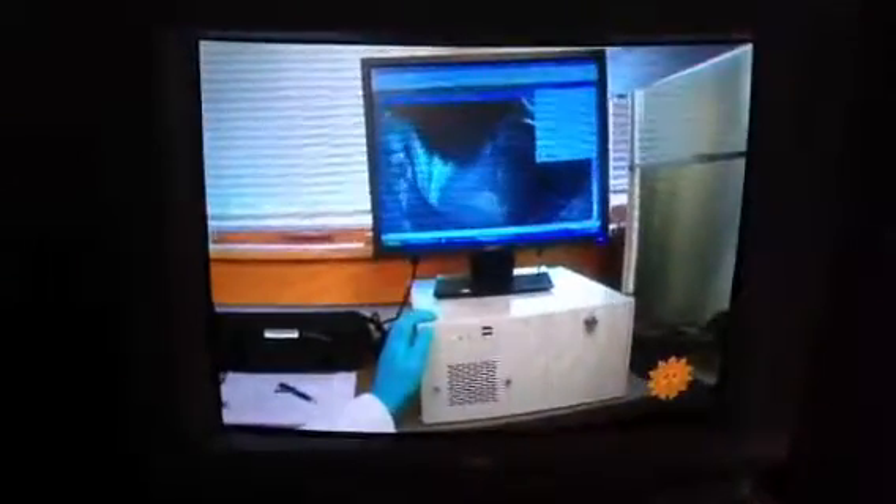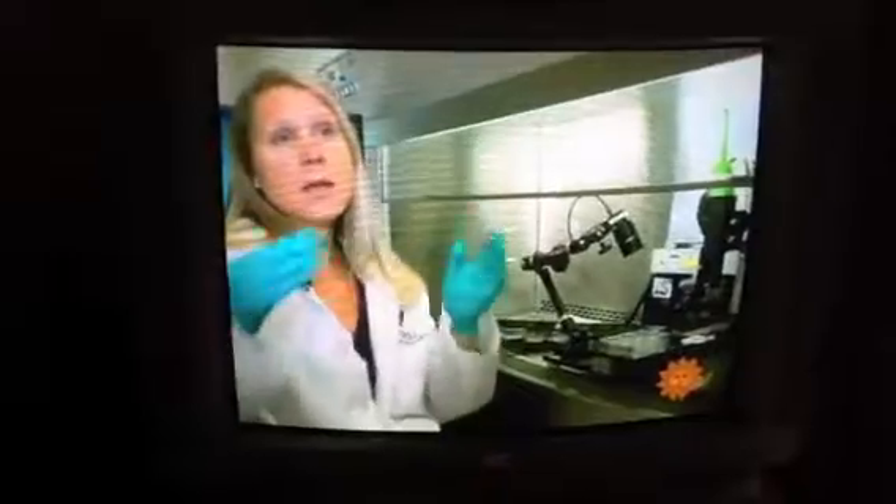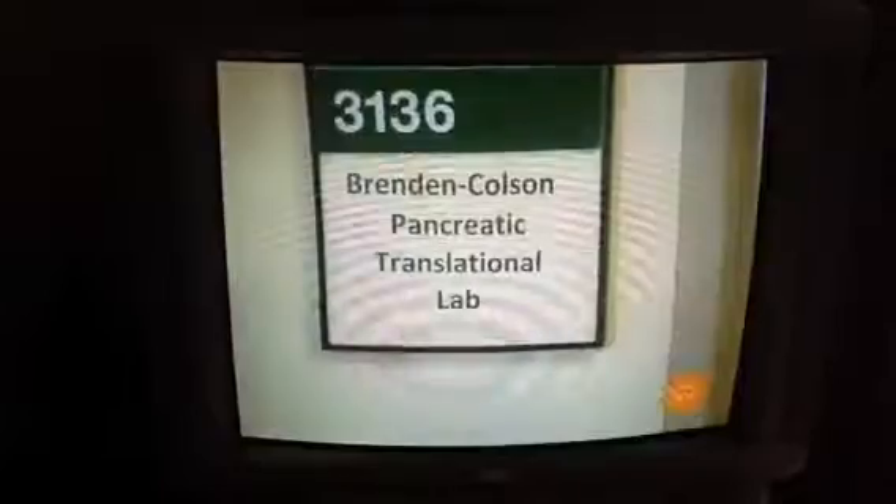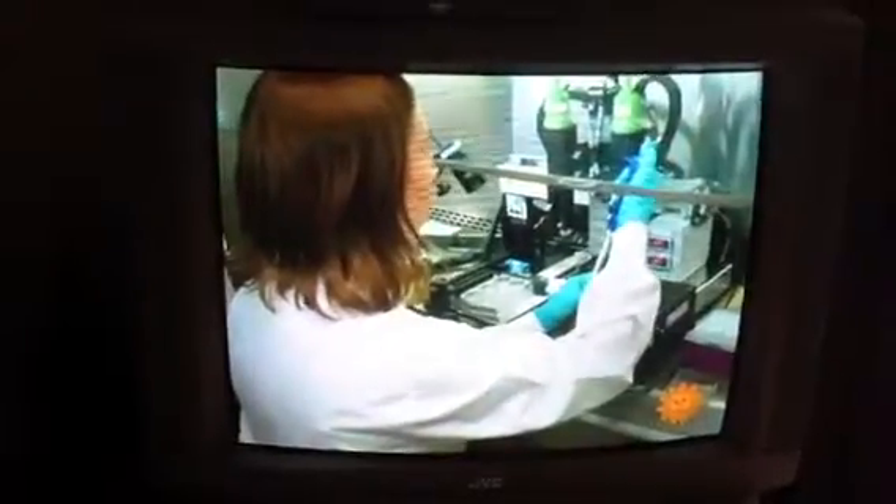Professor Rosalie Sears is printing identical breast cancer tumors. Each tumor will be treated with a different drug. This will allow us to get a biopsy from a patient's tumor in real time, load the printer with the different cell types, and reprint the person's tissue — then, within a week, be able to test it and see what it responds to. Sears thinks within a year, the printer could be used to help figure out which drug can best target an individual's cancer, leading to customized and successful cancer treatment. She's really excited because it could revolutionize how we personalize medicine and treatment.